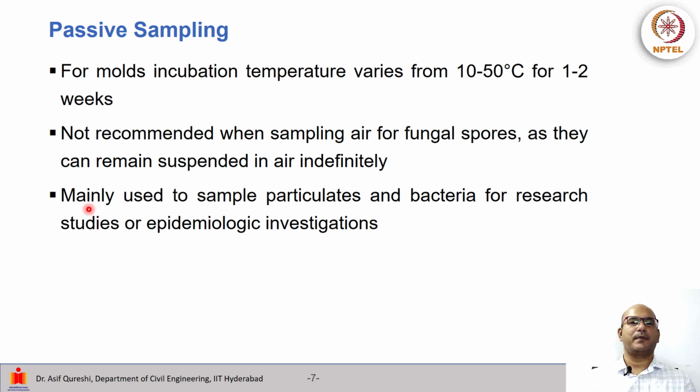Mainly this method is used to sample particulates, which may settle down over a period of time, and bacteria, which also depending on the size fraction will settle. So it's mainly used to sample particulates and bacteria for research studies or epidemiological investigations.